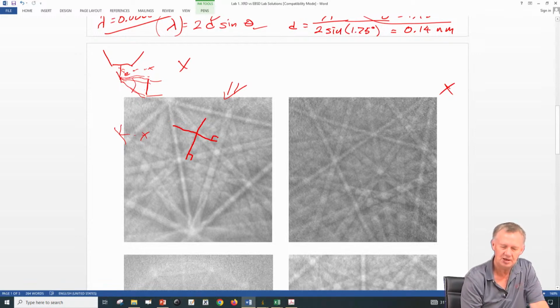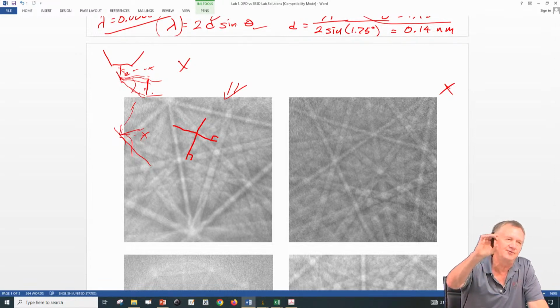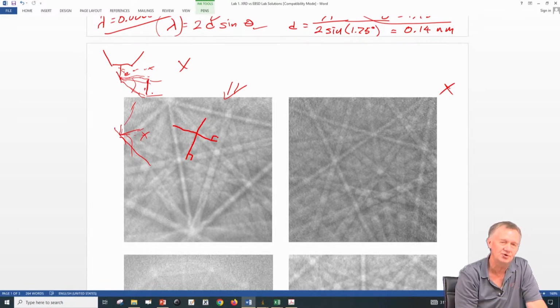If you're way down here, you get your strongest diffraction down here. You maybe get a little bit up there, maybe see some pattern, right? And you'll see that as you move the working distance around, you'll see strong intensity at the top of your detector, at the bottom of your detector. And then you try and do a background correction to smooth everything. But if you just look at the raw image, you'll see exactly whether you're in the center with your maximum intensity or not.